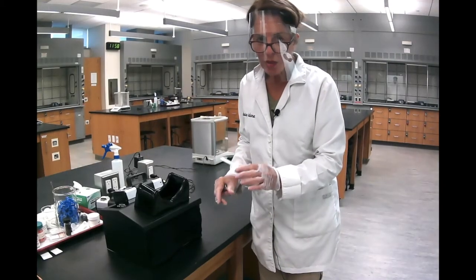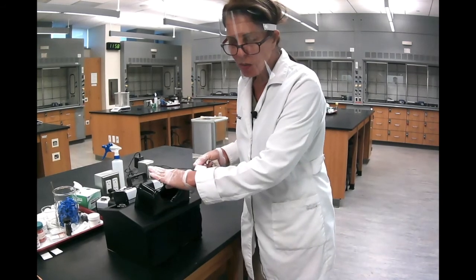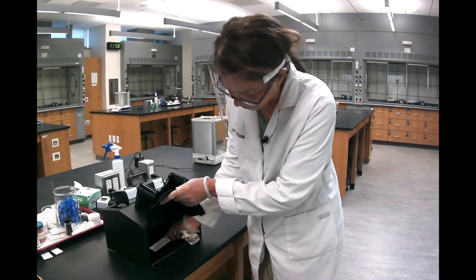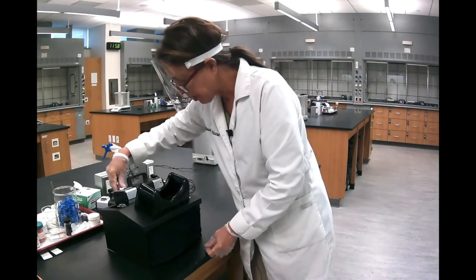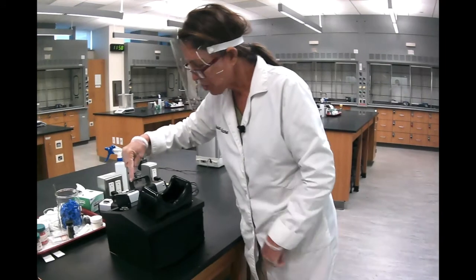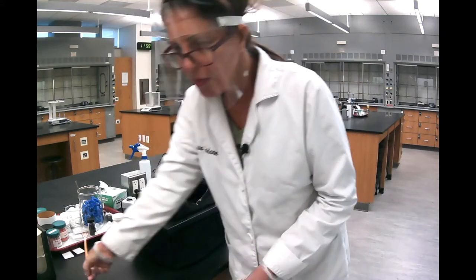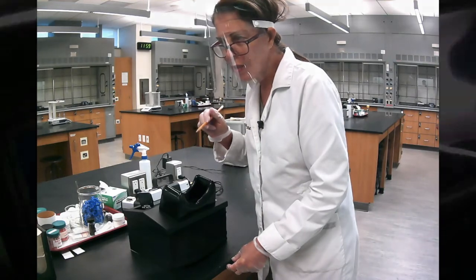So at this point, when your TLC plate is ready, you're going to bring it to this box where we have UV light. You see we have this black felt to cover. You put it inside and you push the button. Of course, we can't see it from the video here, but you push the button on the UV light to turn it on, and with the pencil, you go inside and you circle, you contour the different spots.